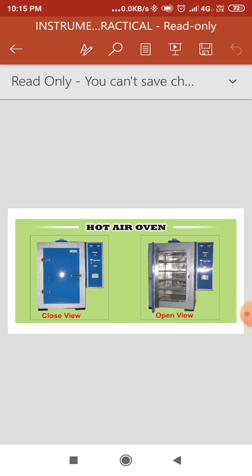Sterilizing by dry heat is accomplished by conduction. The heat is absorbed by the outside surface of the item, then passes towards the center of the item, layer by layer. The entire item will eventually reach the temperature required for sterilization to take place. Dry heat does most of the damage by oxidizing molecules. The essential cell constituents are destroyed and the organism dies. The temperature is maintained for almost an hour to kill the most difficult of the resistant spores.